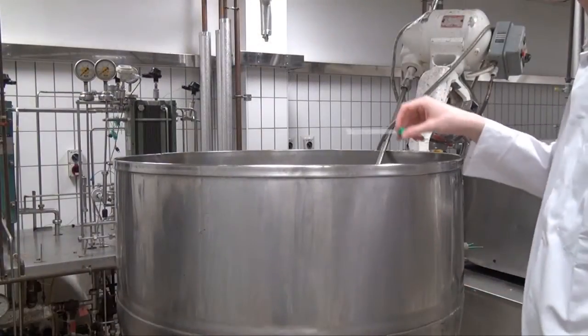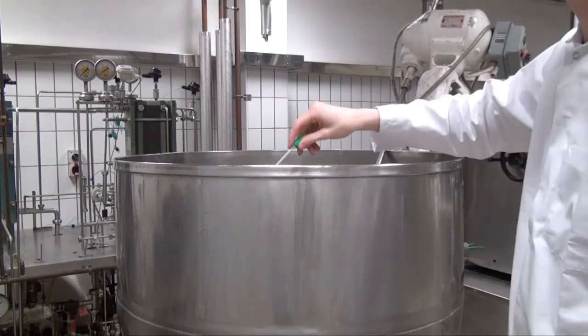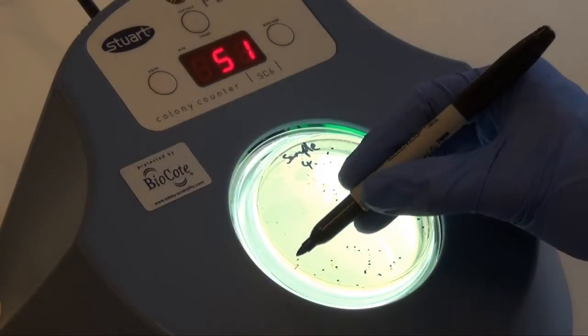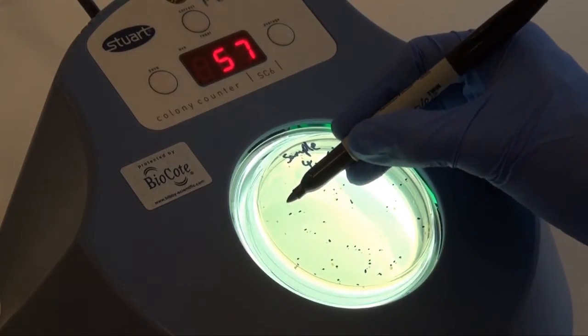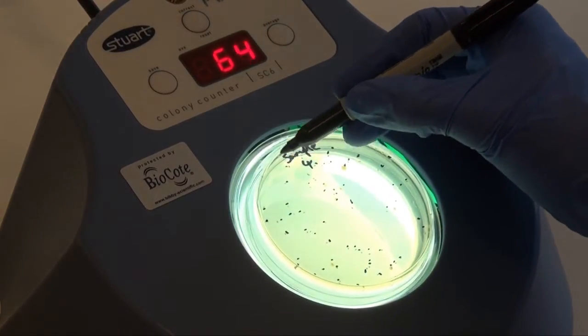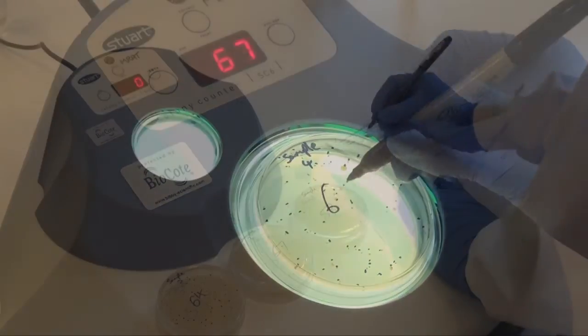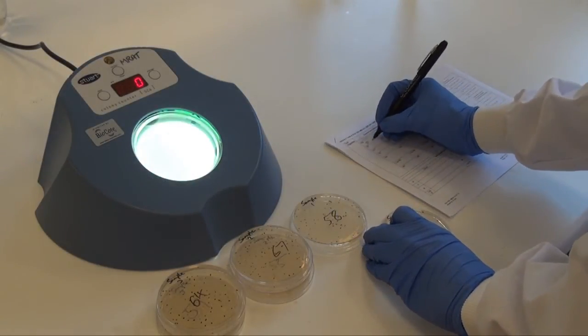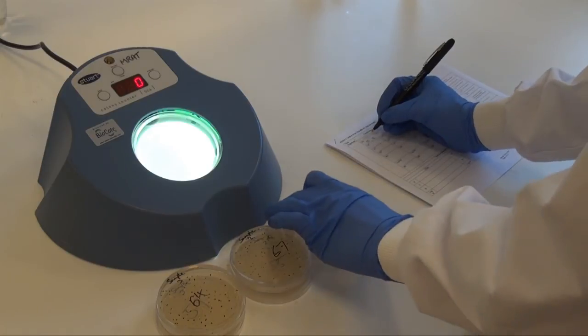The number of microorganisms present on surfaces can be determined before cleaning, after cleaning, and after disinfection. Results can be compared to ascertain whether there is a reduction at each stage of the clean, and to compare the effects of the trial disinfectant with an existing product.